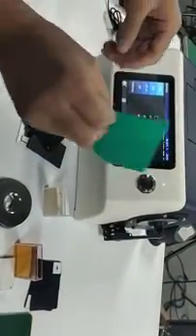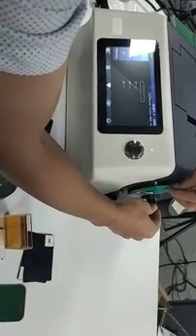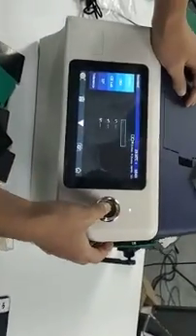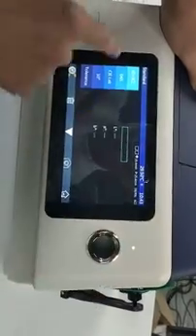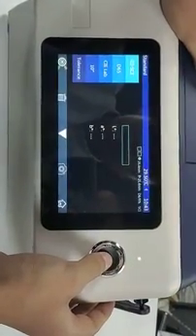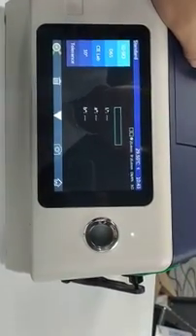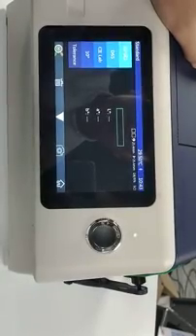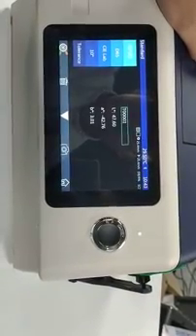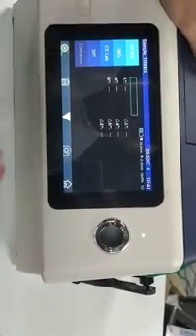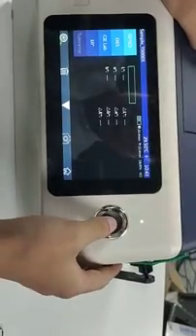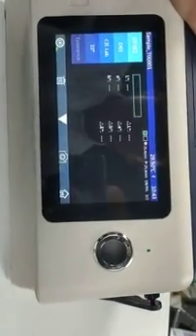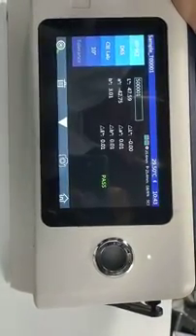Check this. Standard measurement. Measure standard. Measure standard. Ok.